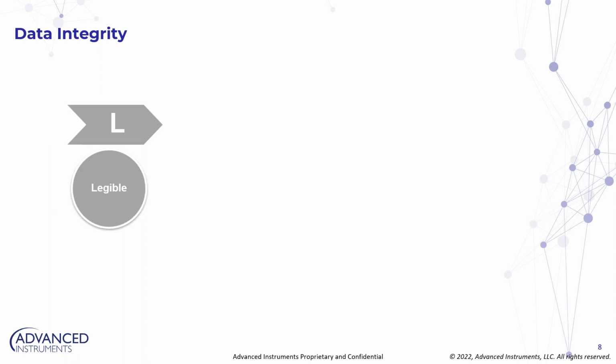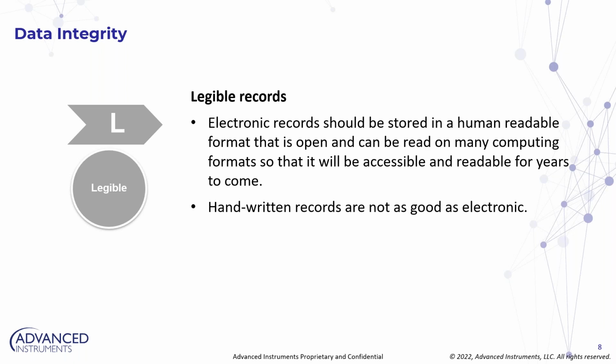Back in the day, doctors would scribble and have really bad handwriting, and you can't understand what they've said, and you go to the medical shop to get your drugs and you have no idea. That's a joke, but since then, everything's electronic, you know, they type it out. There's no error in understanding what is written. In exactly the same way, electronic records need to be in a human readable format. They need to be very clear, legible. Anybody should be able to understand what it is.